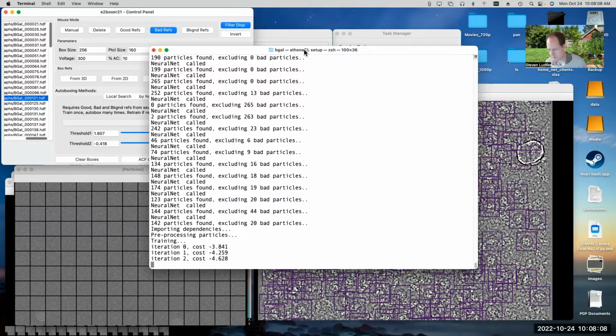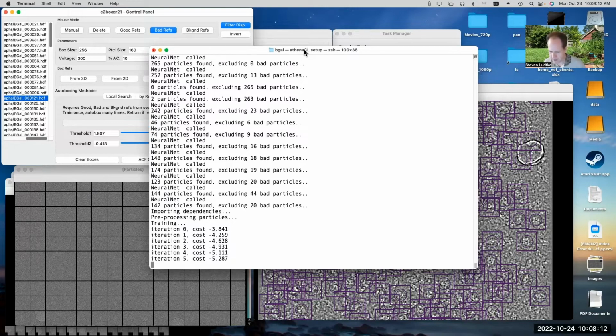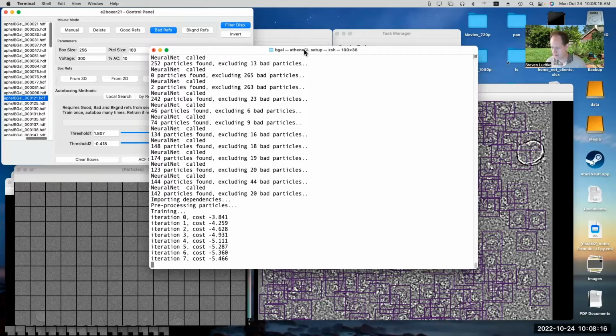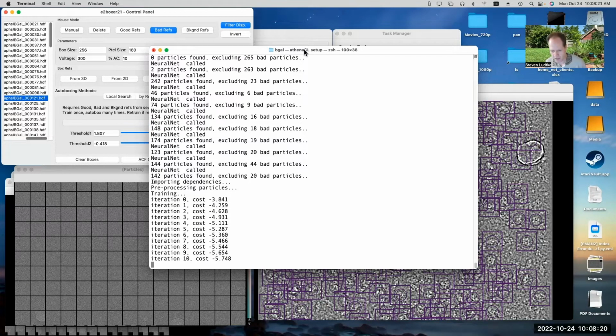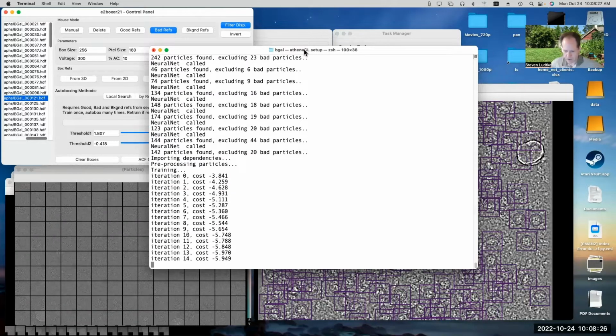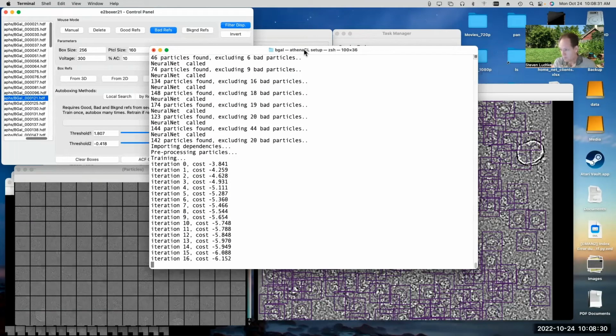If you're using an NVIDIA processor on a workstation instead of my little Mac Mini, you get a lot more acceleration out of the deep learning process than you get from the M1 Max chip at this early stage. So this will run substantially faster if you've got a Linux workstation. Anyway, we'll let it go. Any questions about this while we're waiting for the next couple of minutes?